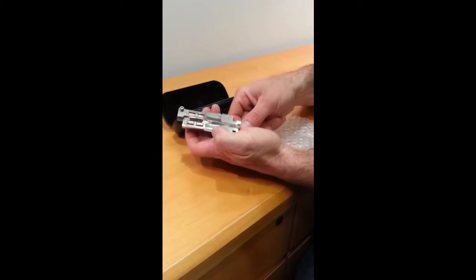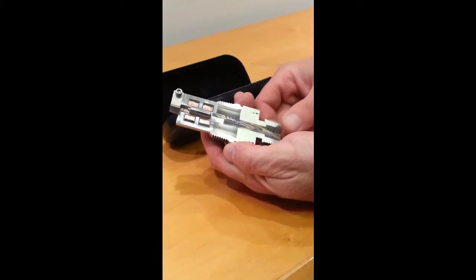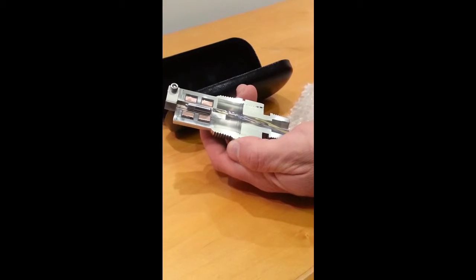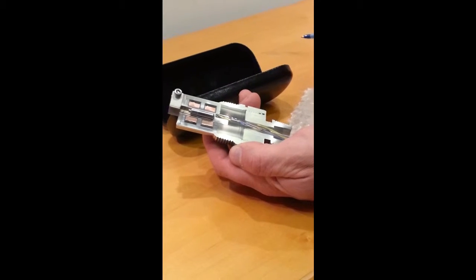So what we have here is a cutaway of our 301 sensor. Our 301 sensor is an inline viscometer that measures viscosity, temperature, and temperature compensated viscosity.